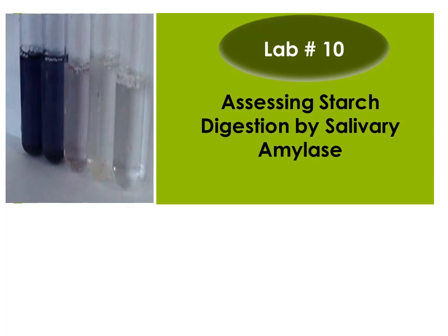Dear student, my name is Dr. Mohammed Irfan, and the topic of our experiment today is to assess digestion of starch by salivary amylase enzyme.